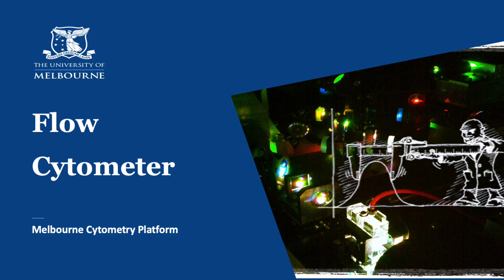Now, for most of the lecture, I will be talking about what is a cytometer and what are the elements that make a cytometer, including elements of fluidics, electronics, and optics. And although it looks like maybe too much information, I think it's essential because most instruments at this point are enclosed. You cannot see the elements, and issues that you can have with the instrument can be related with any of the subsystems. So knowing how the instrument operates inside the box is important to make sure that you get the best out of the cytometry techniques.